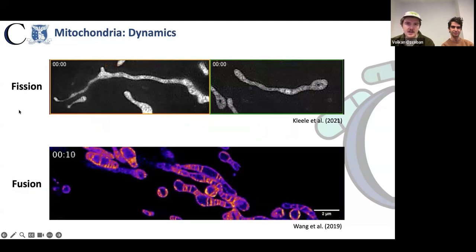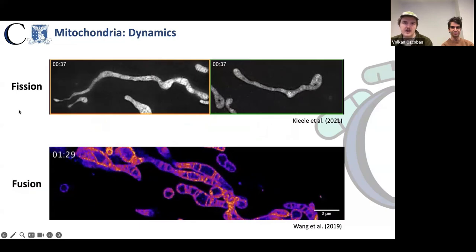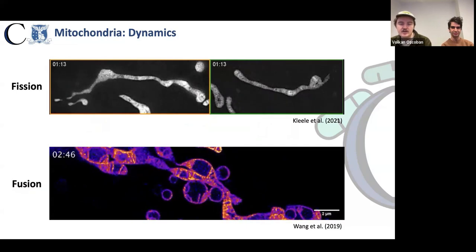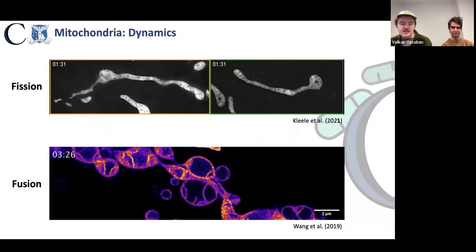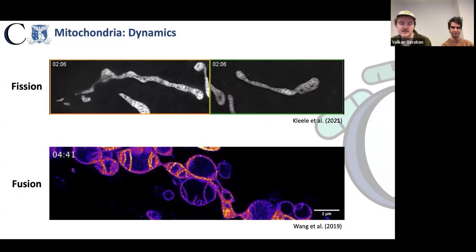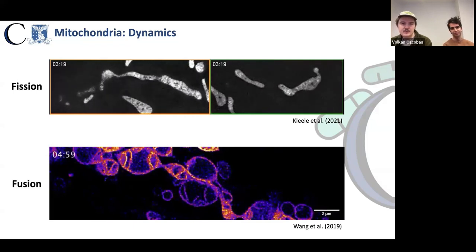The second challenge is in quantifying the dynamics to give us better insights on how they change both in morphology and cell-wide arrangement. These take the form of both long-term migration events that happen over minutes and hours, and local dynamic events like fissions or fusions, which happen at the scale of seconds. This is all to say that dynamics and morphology can't be considered separately, which is why there is a real need for simultaneous analysis. For example, the impact of modulation of fusion and fission events on longer-term emergent network structures and properties remains unclear to this day.